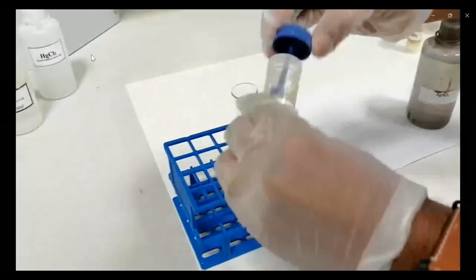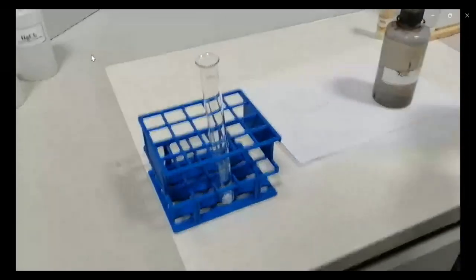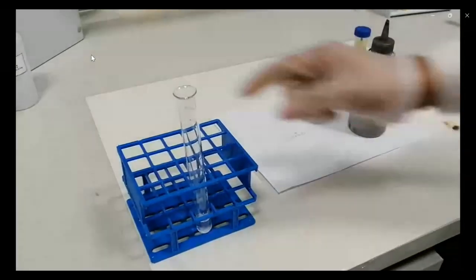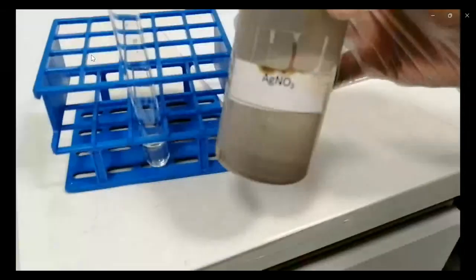In case of thiosulfate, we are going to do it in a solution because it's a confirmation test. Prepare a solution first, a few crystals plus milliliters of water, and then add silver nitrate.